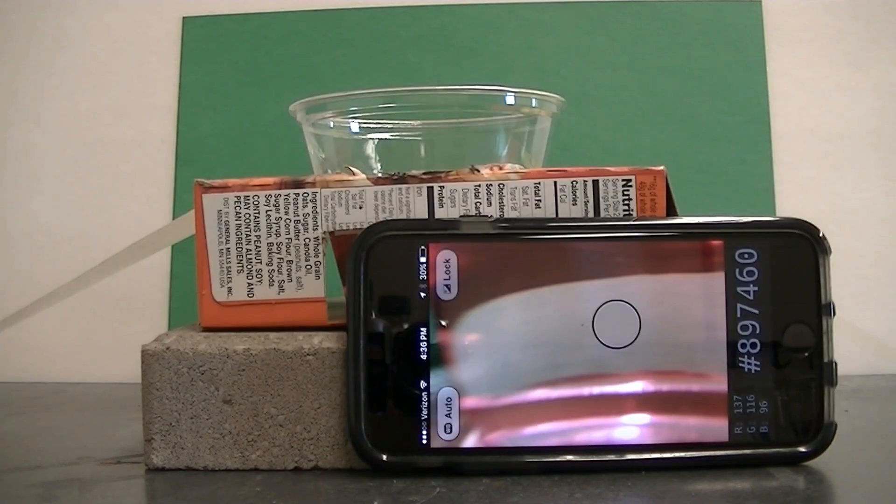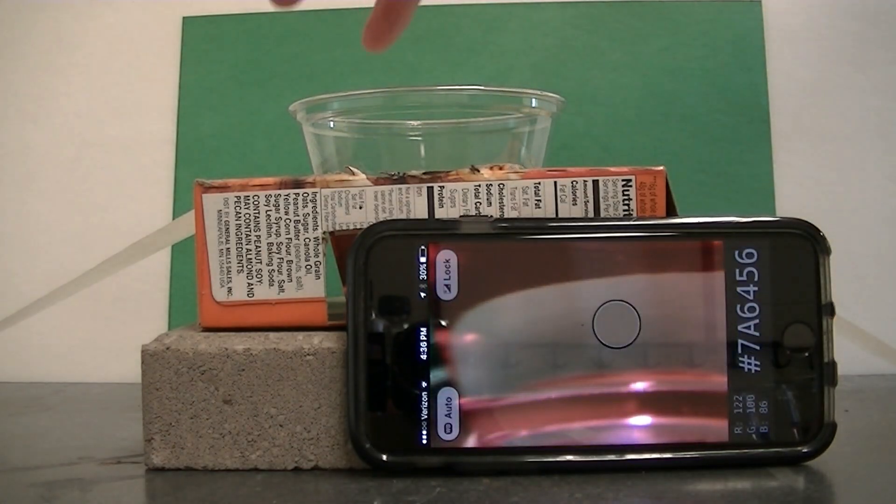Well now it's time to analyze the data. See if we can't figure out what the concentration of red dye number 40 is in strawberry Powerade Zero.